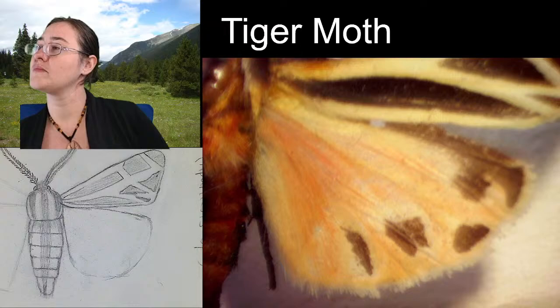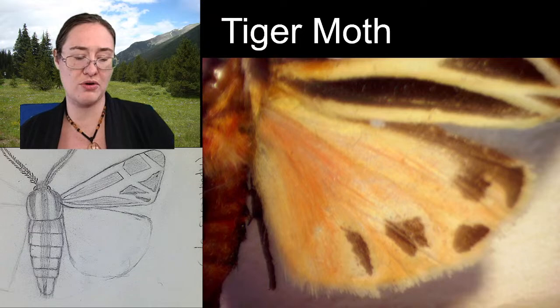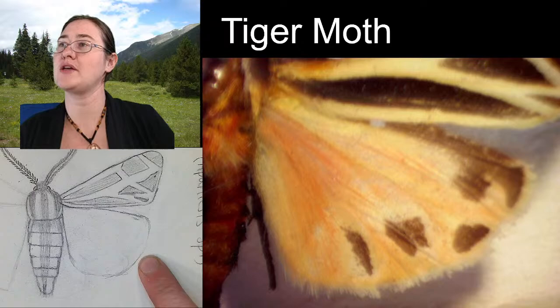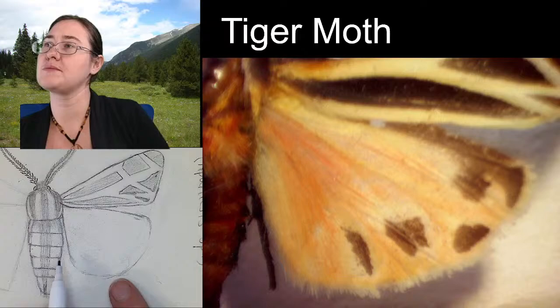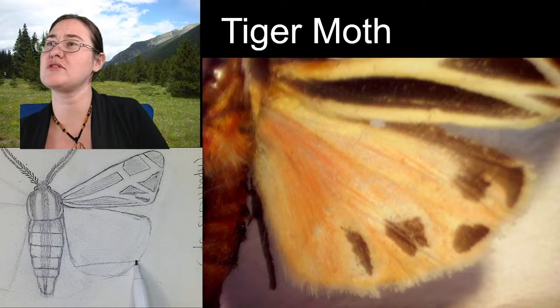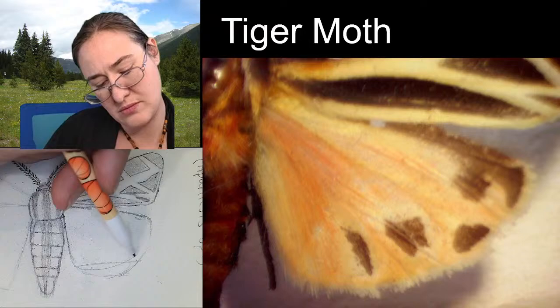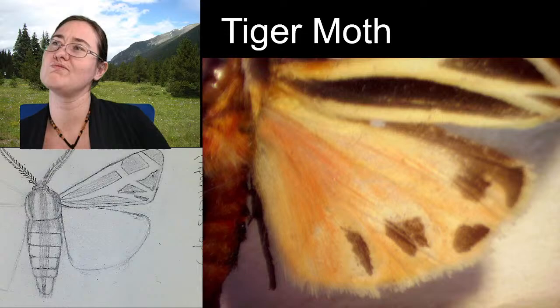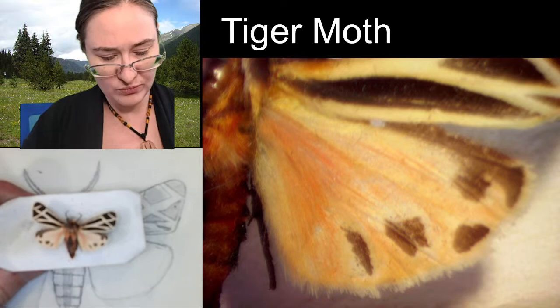Make the outer edge of the hind wing go horizontal. I'm going to pull the specimen.